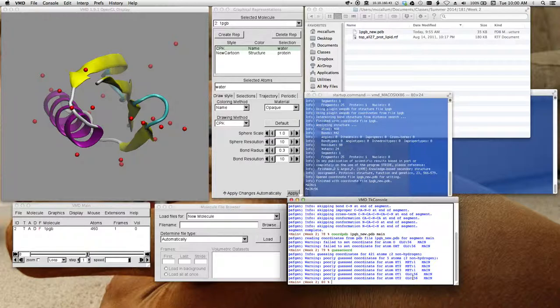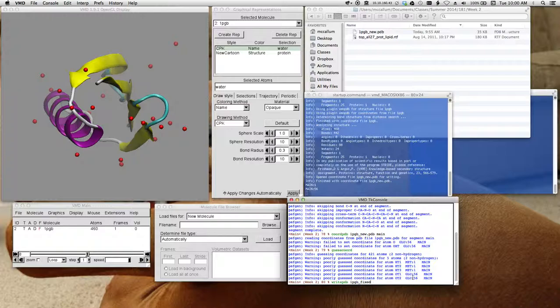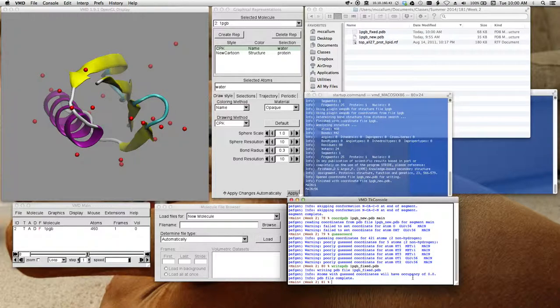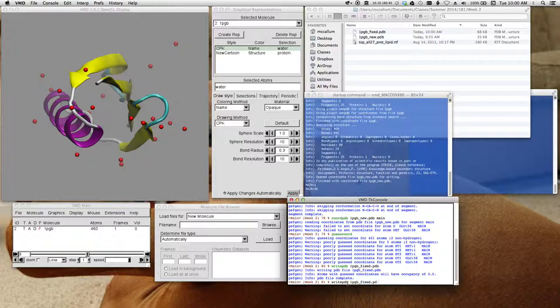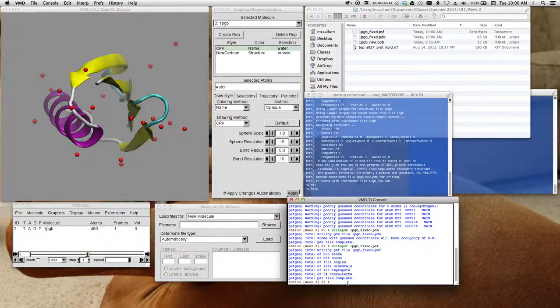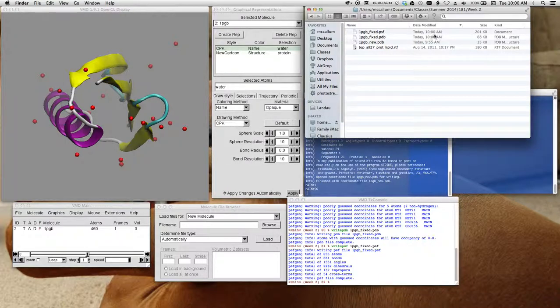Now, what I want to do is write my new PDB. Right now, the PDB is just stored internally. 1PGB fixed PDB. Right now, up here, we can see that it's there. And now, I'm going to use the up arrow key to do the next command and just edit it. So, I'm going to do up arrow, which recalls the last command. And I'm going to edit what I just typed and replace all my PDBs with PSF. And you can see that it gave me some information and the PSF file is here, too.